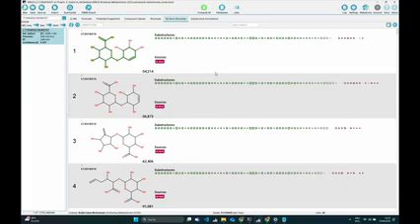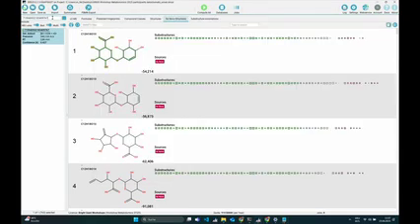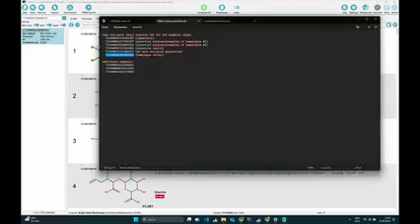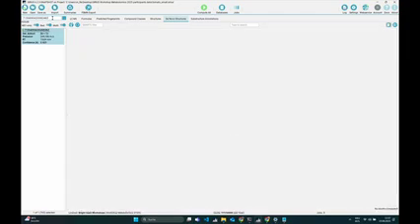Okay, we still have half an hour, and I think we have a few more examples. One example I can show you very quickly is there's now the option for homolog series that you can detect them. We will just copy and paste this feature ID. And before we can look at something, I just want to show you, you will have to enable something, and that is in the settings panel, which I haven't shown you before.